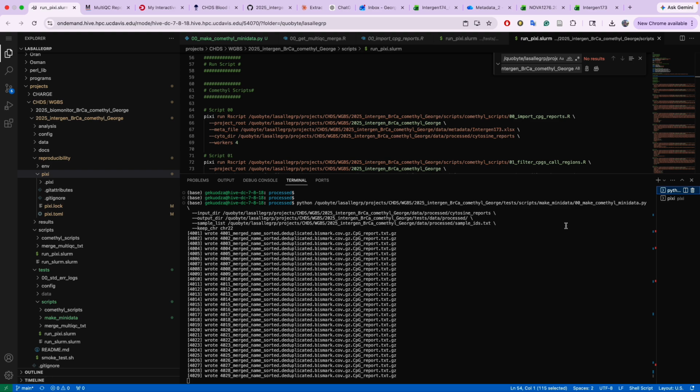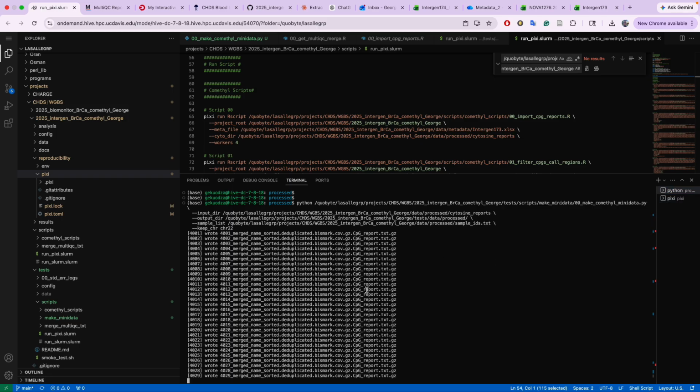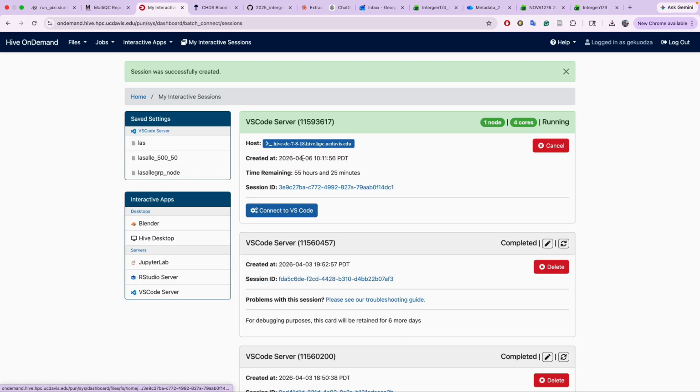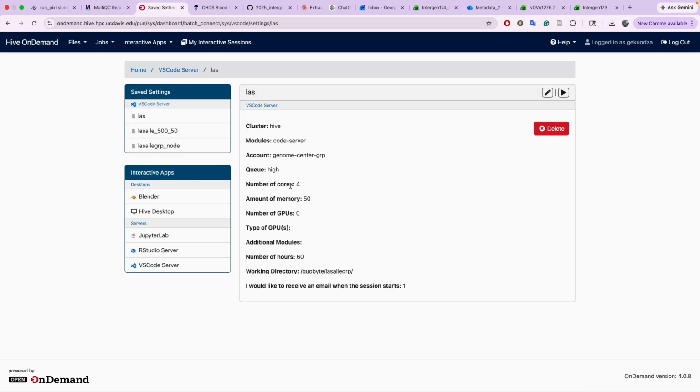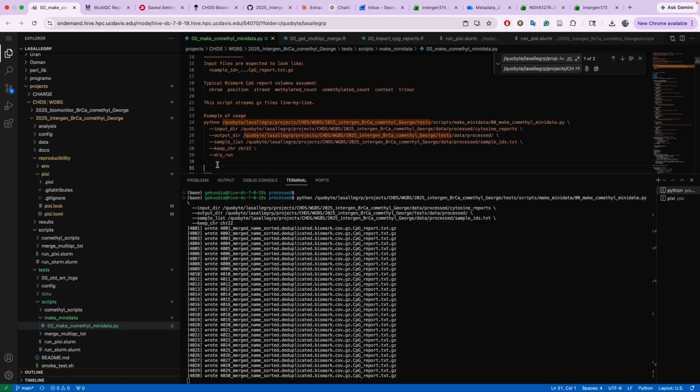I was considering whether we should just submit a job and add more CPUs, and then it'll be faster. Instead of 59, something higher. No, I mean this is running based on the settings I have, so it's only using 4 CPUs. Oh, okay. So if we submit this script that we have as a job, then it might go a little bit faster.